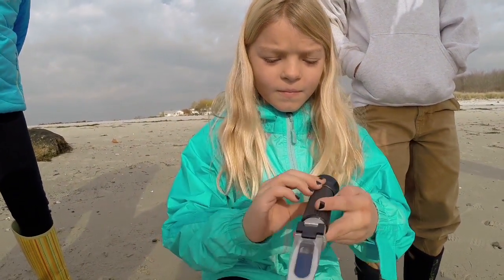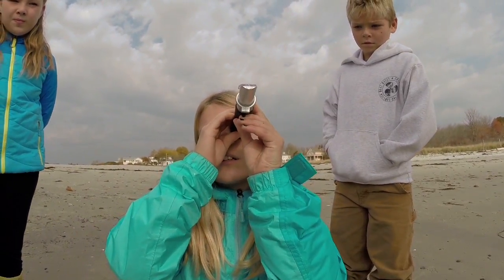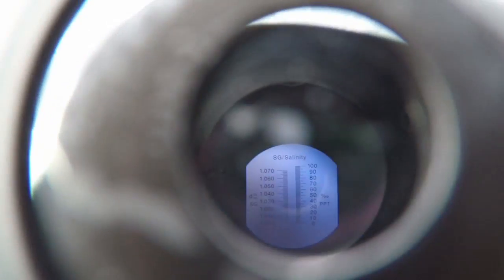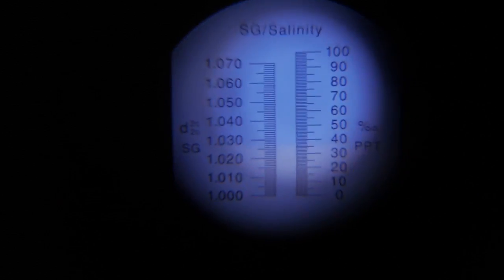So when you're looking through there, describe what you see. The white line. So you're seeing where the line is, and how much salinity do we have in the water today? We're tracking the water quality now, and we'd like to get really good at it so the state will accept our results, so that the students can actually have a part in lifting the zoning lines so we can have aquaculture right here on our little island.